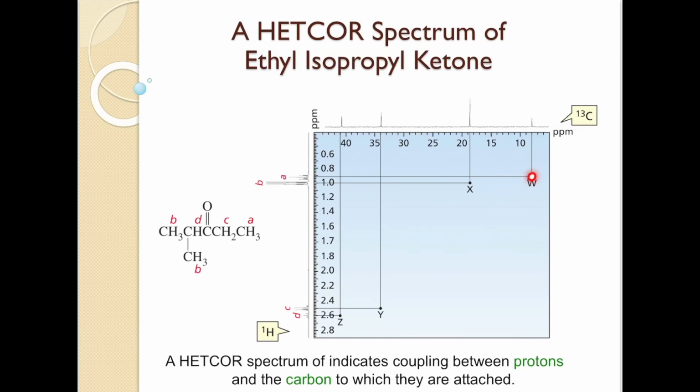Say, for example, if you take the cross peak W, then again, you drop a line, one against the y-axis and another against the x-axis, and you can see that these protons are attached to the carbon that's producing the signal. So again, these 2D NMR spectra are going to be useful in determining the coupled protons and also going to simplify the interpretation process.